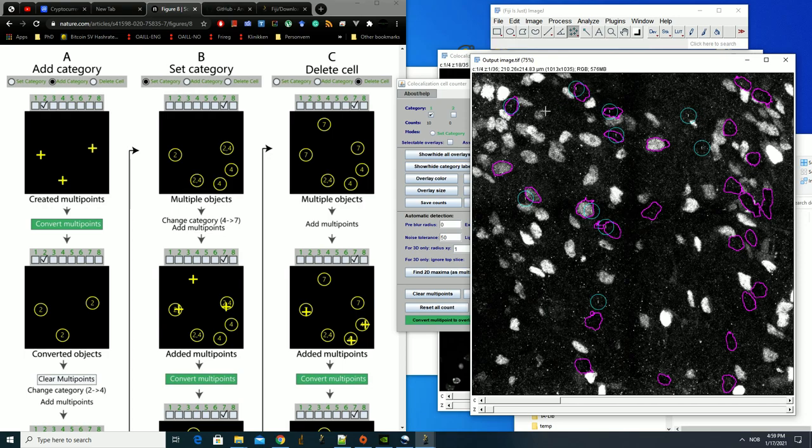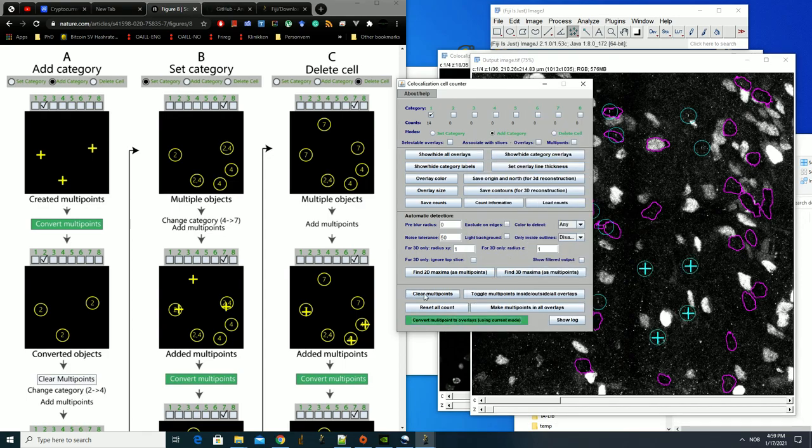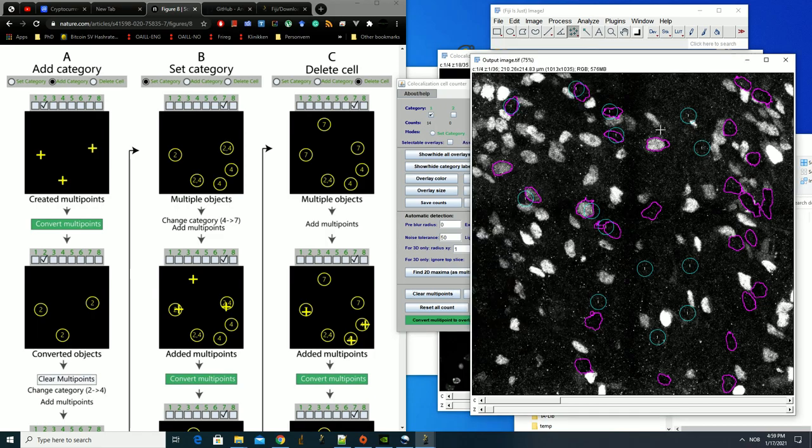So you are claiming here that we have 10 cells, and these are all category 1. That means that they have no signals, and you could add more, and you could click the green button, and let's clear it again, and you see now we have 14 cells with the specific X, Y, and Z location.